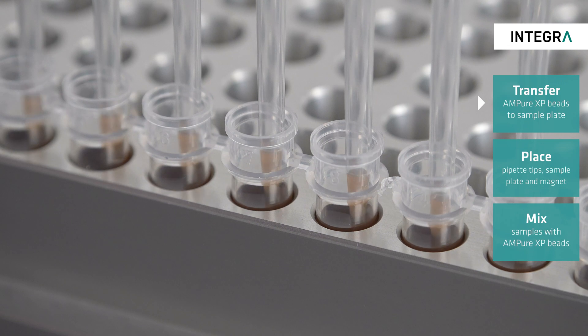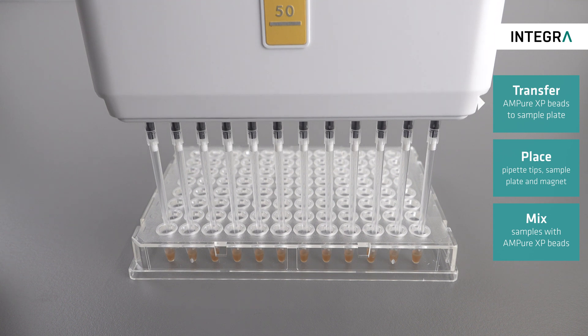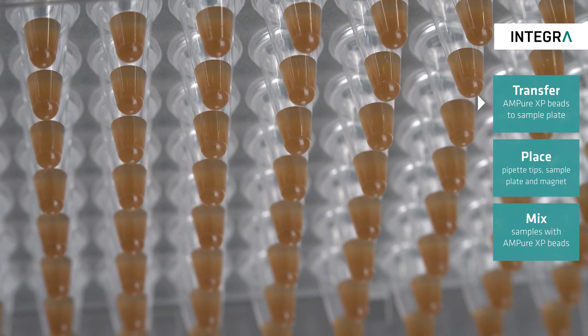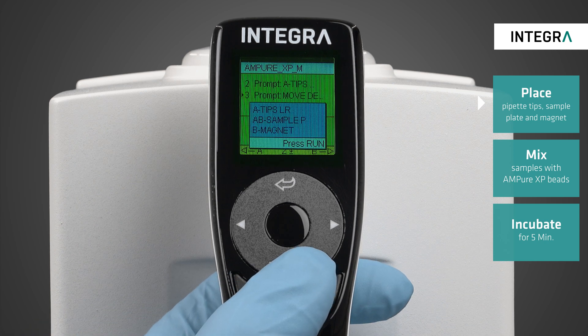Afterwards, a 50µL 12-channel VIAFLOW pipette can be used to transfer 18µL of the beads from the PCR tubes into a 96-well plate which has already been filled with 10µL of the desired samples. Now we are ready to transfer the sample plate to the VIAFLOW 96 to begin the purification process.